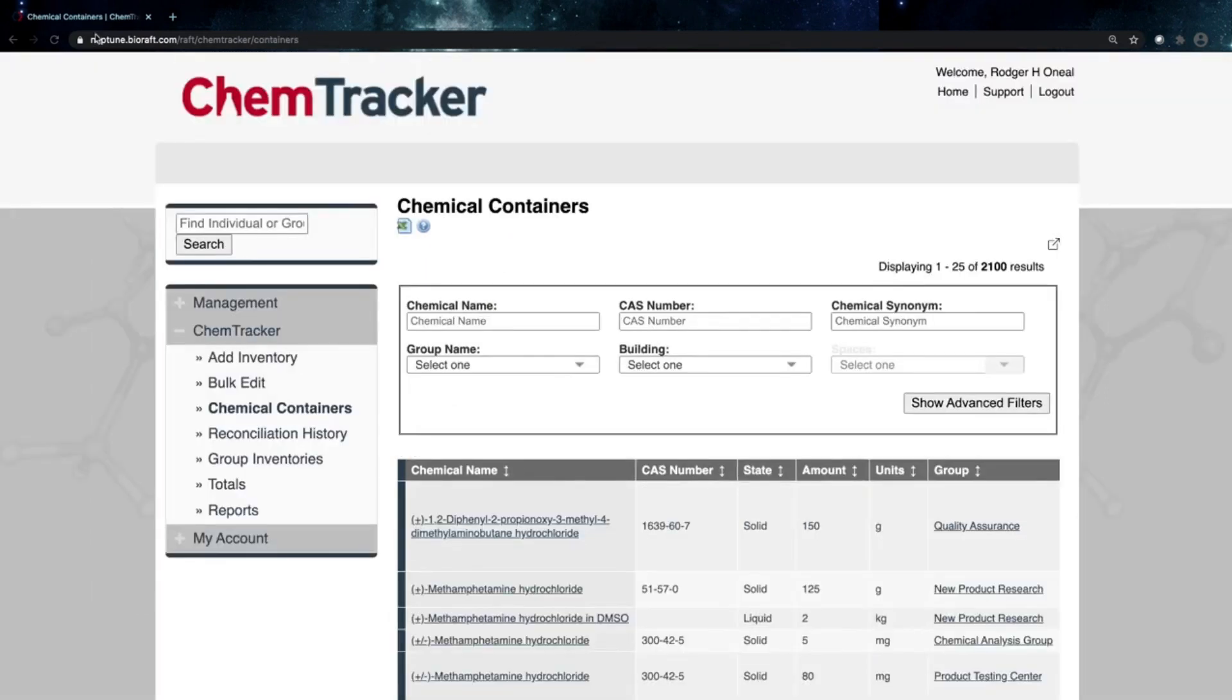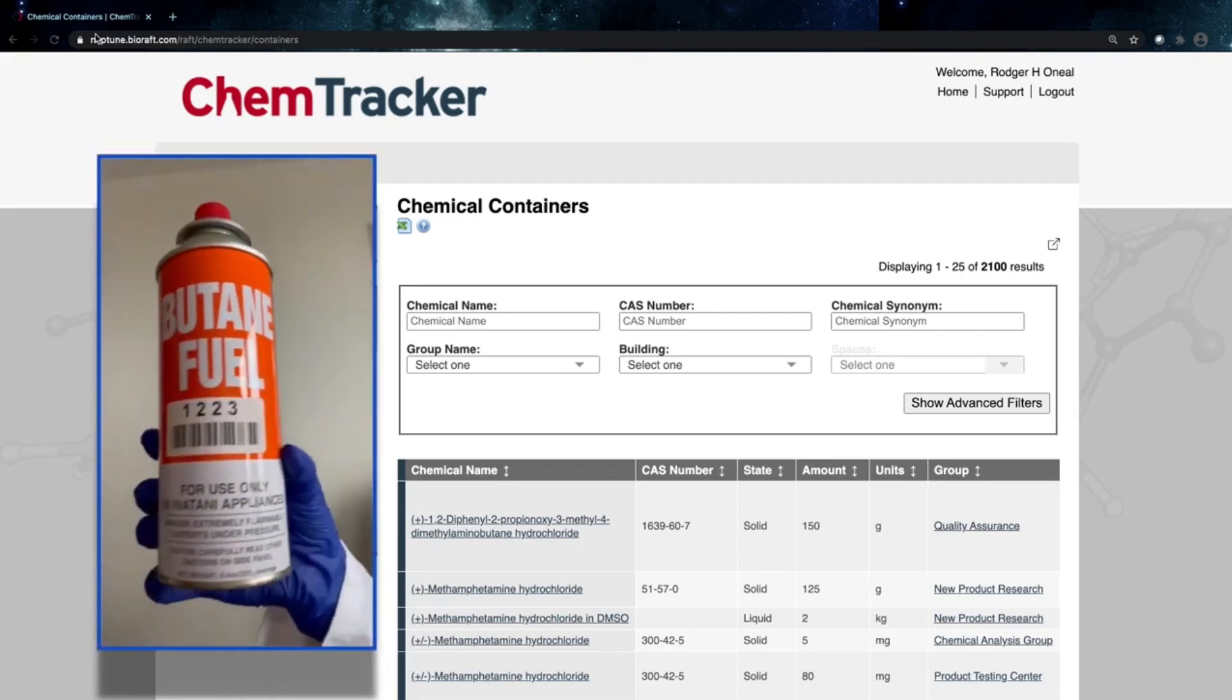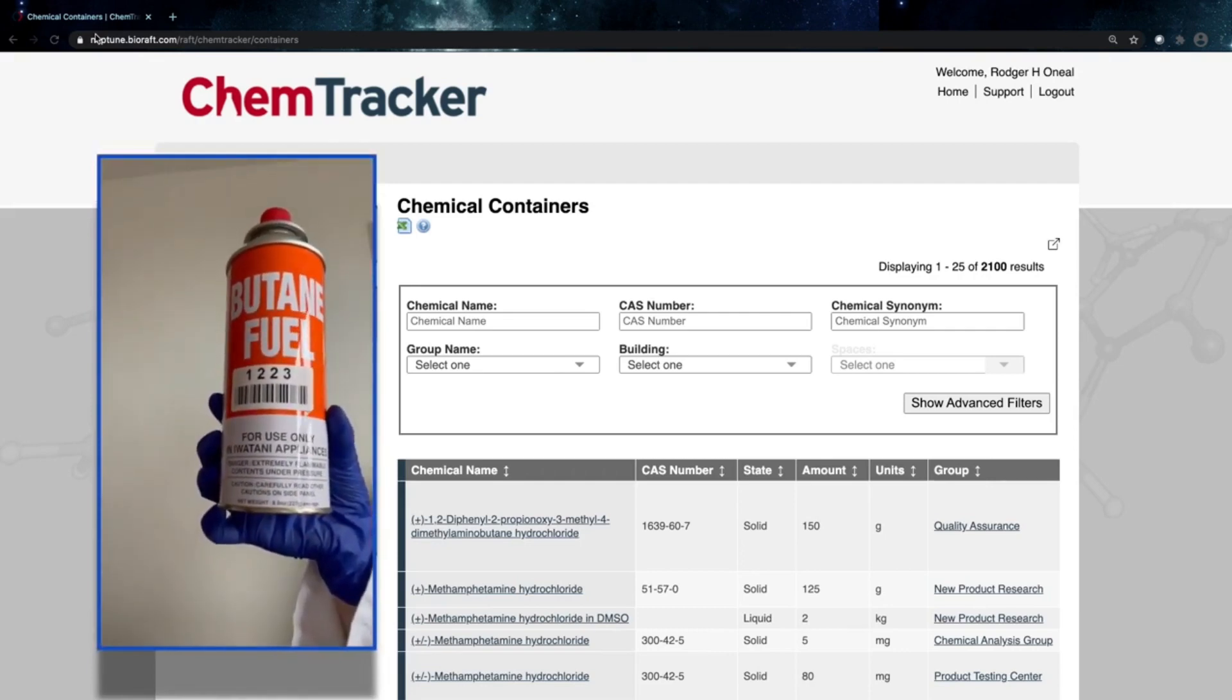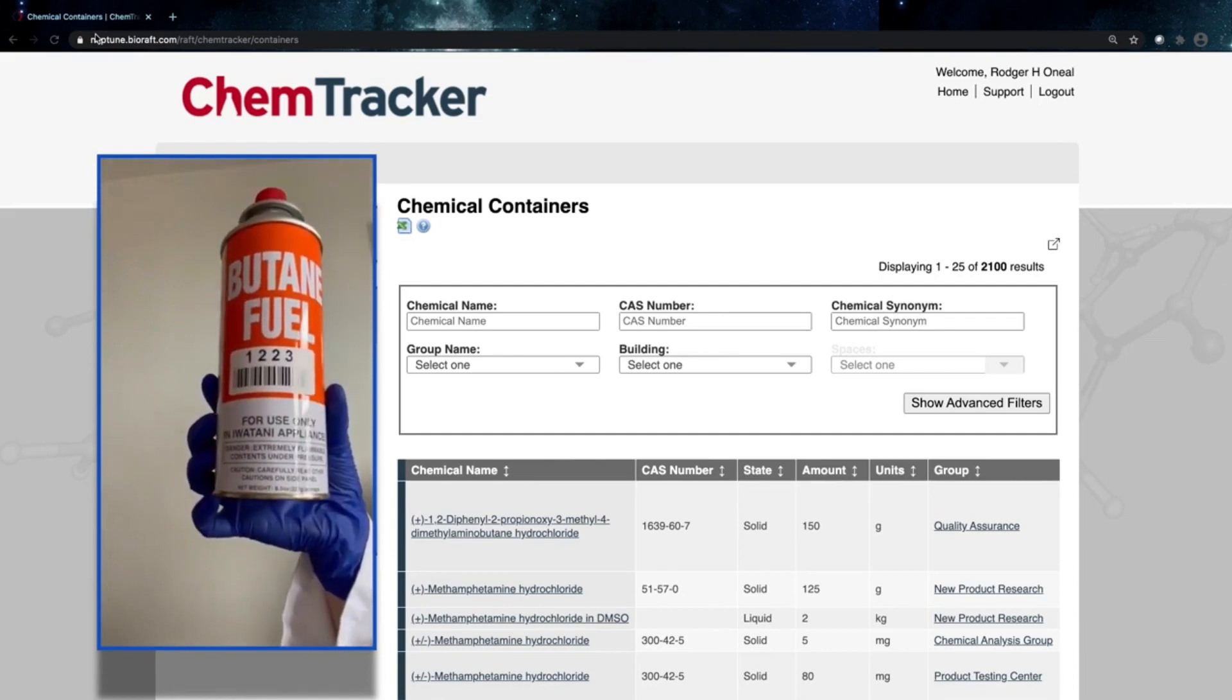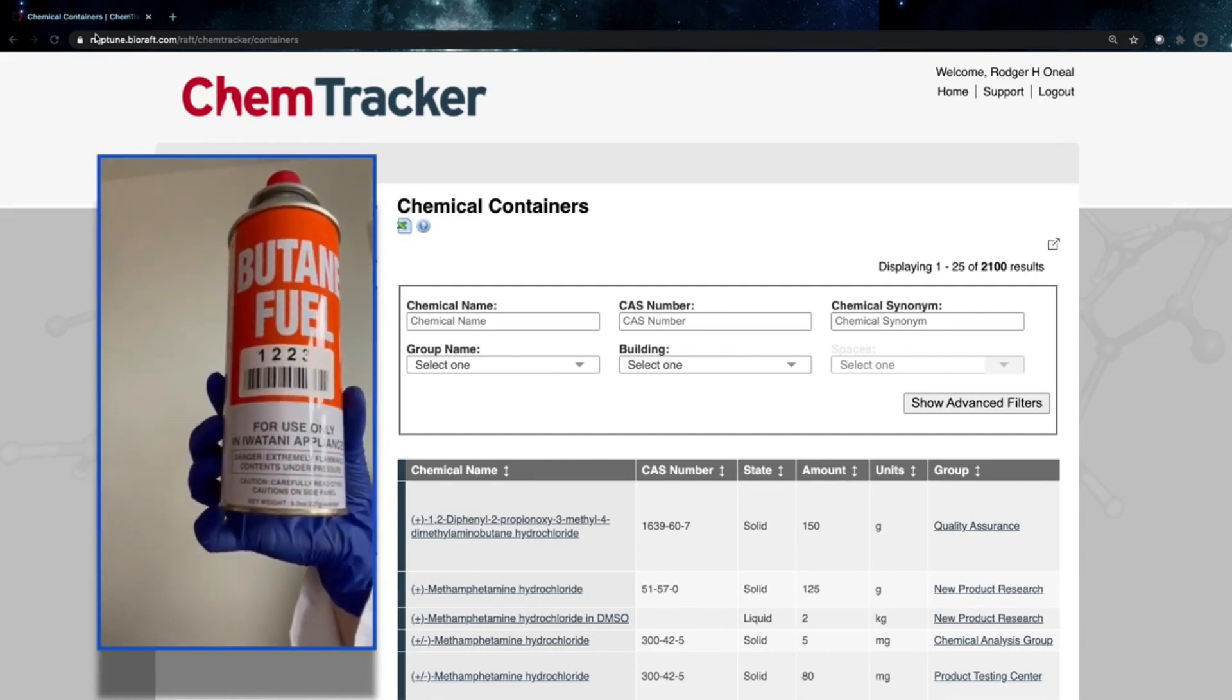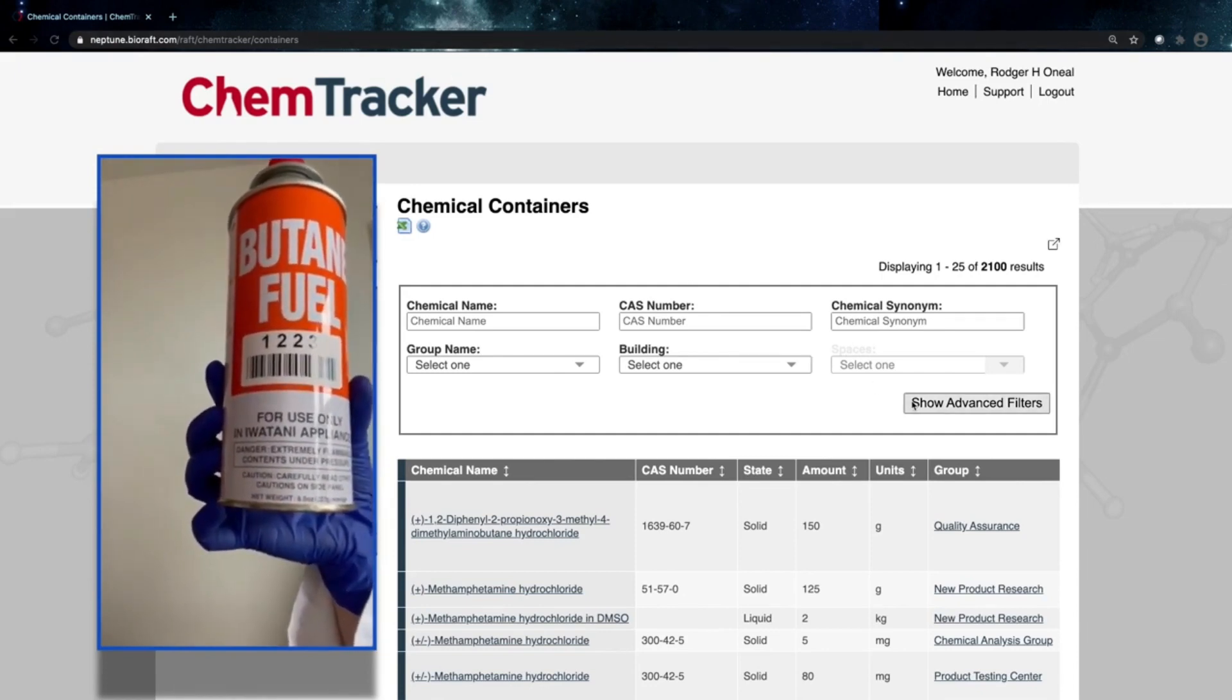Today we're going to show what you can do with a barcoded chemical once you find it. So let's say I found this container of butane fuel. I see it has a barcode label right here that I know that someone on my team already applied. Let's see what we can do to find where that chemical is supposed to be.